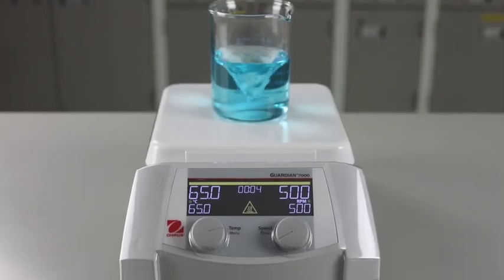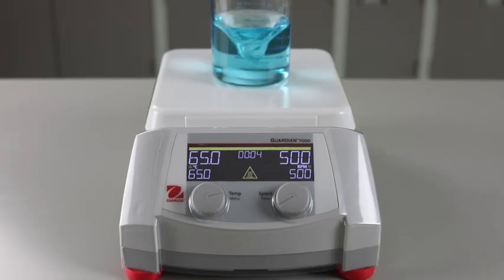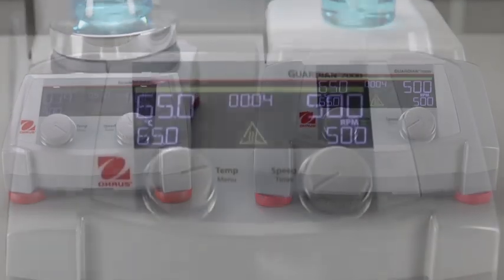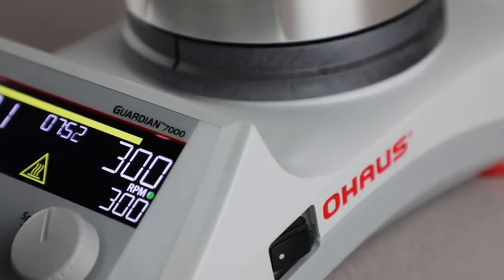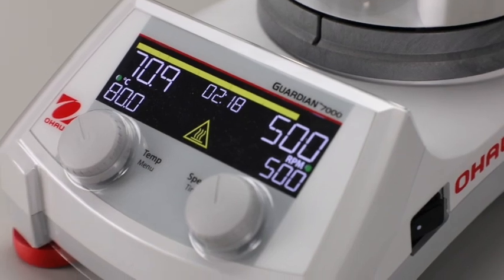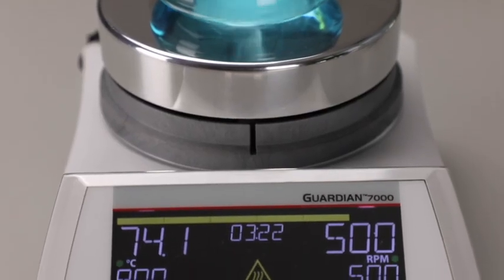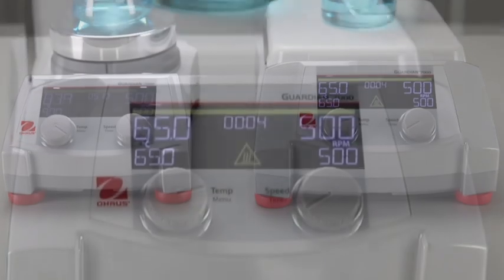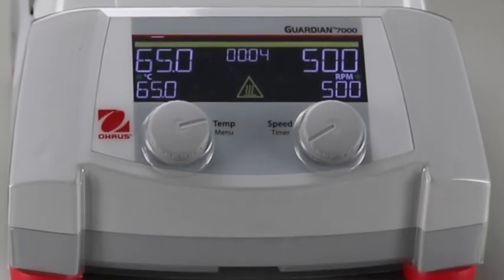O-House has designed the new Guardian 7000 series hot plate stirrers featuring our exclusive smart technology to improve the standards of lab safety, efficiency, and durability that has become synonymous with the O-House brand. Designed to reduce the chance of accidents with advanced safety features, as well as superior performance combined with affordability to reduce the high costs of operating a science lab.